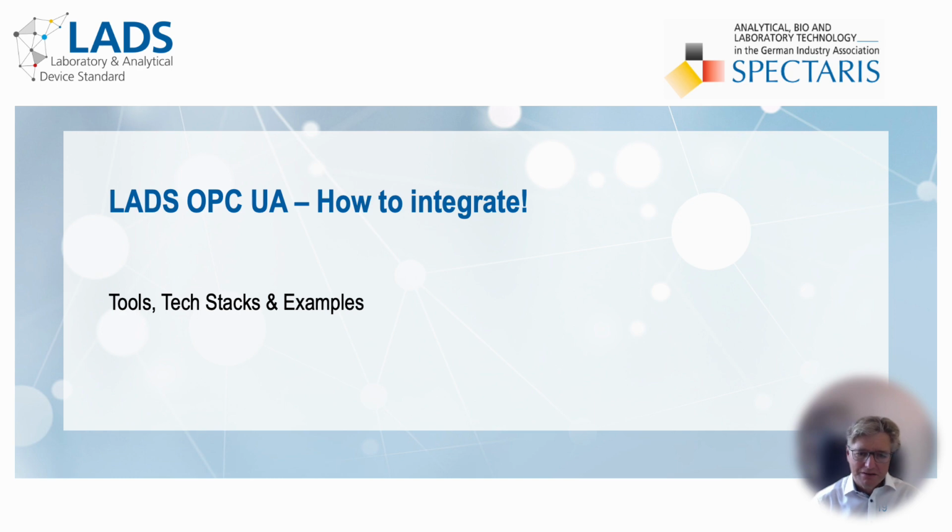As mentioned earlier, people often wonder about the difficulty of integrating LADS OPC UA and whether there are any tools and examples available to facilitate the process. In the following slides, I'll walk you through the development workflow for devices, providing insights in how LADS integration takes place during our hackathons and workshops.